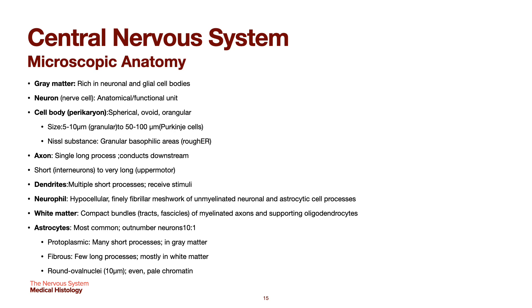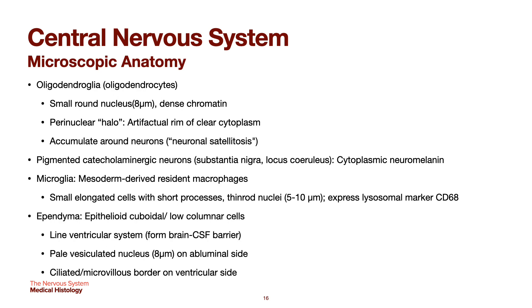Neuropil is a hypocellular, finely fibrillar matrix of unmyelinated neuronal and astrocytic cell processes. White matter consists of compact bundles of myelinated axons and supporting oligodendrocytes. Astrocytes are the most common glial cells, outnumbering neurons at a ratio of at least 10 to 1. There are different types of astrocytes: protoplasmic, fibrous, with round oval nuclei. Oligodendroglia or oligodendrocytes have small round nuclei around 8 micrometers with dense chromatin and a perinuclear halo. They accumulate around neurons — we call it neuronal satellitosis.